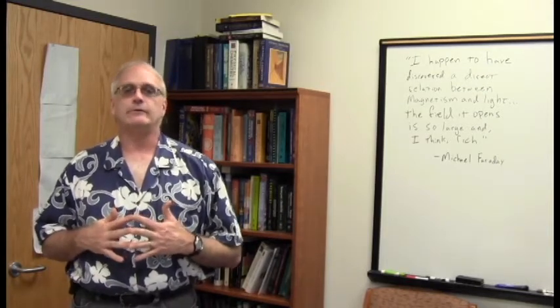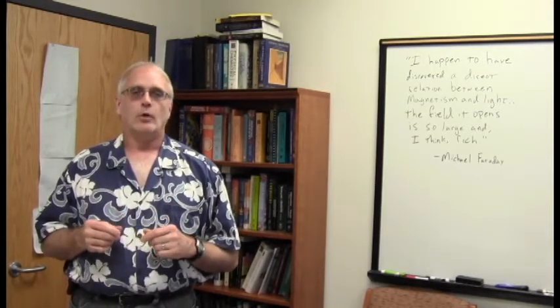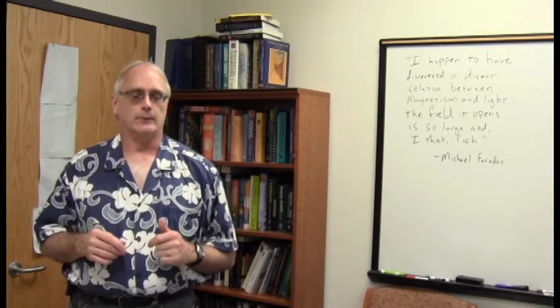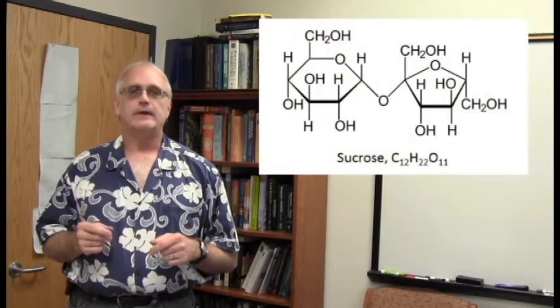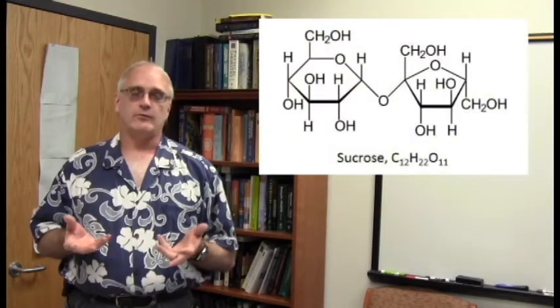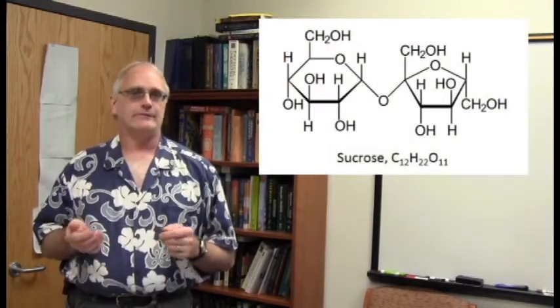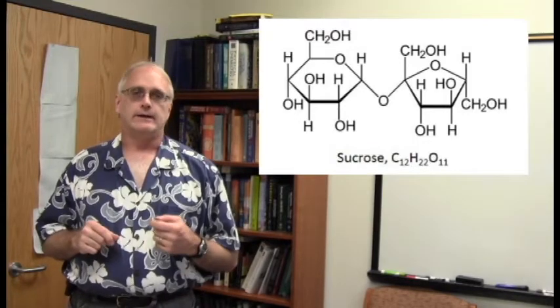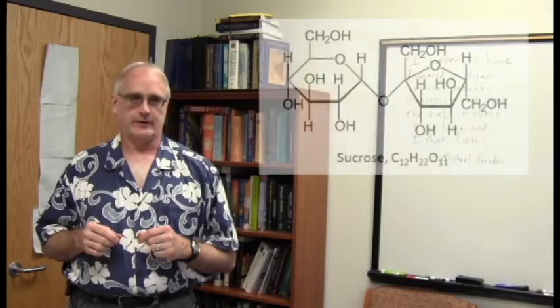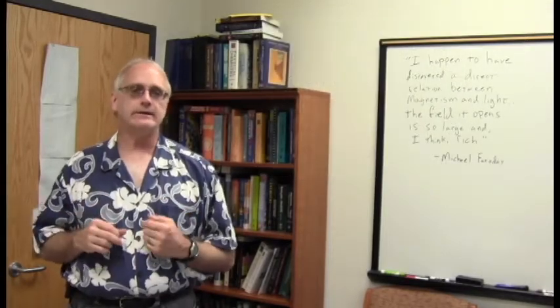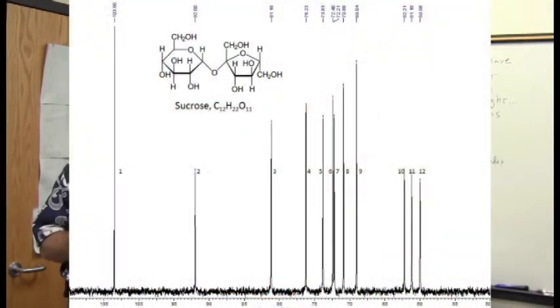I'm going to show you two sets of these spectra, one for a known molecule, one for an unknown. The known molecule is going to be sugar, sucrose. Almost everybody may be familiar with its formula, C12H22O11. It has 12 carbons in it. Here is its carbon spectrum, and indeed it does show all 12 carbons.